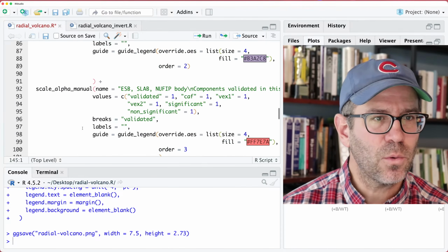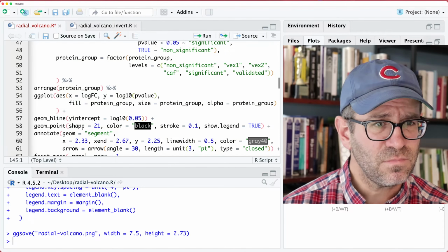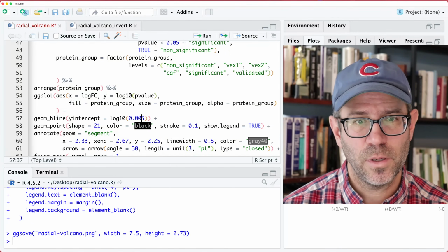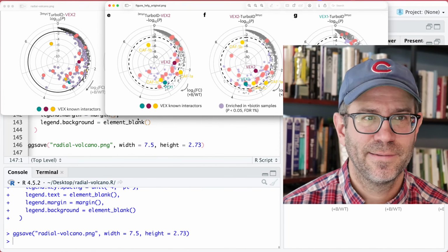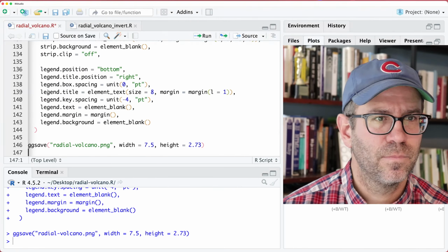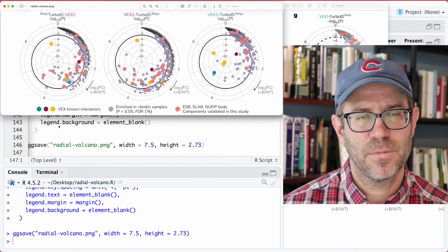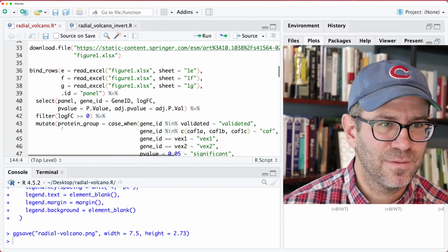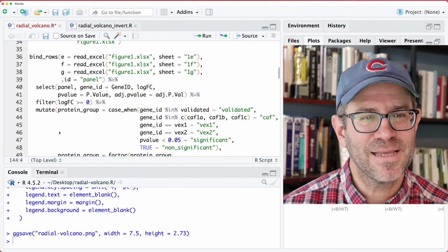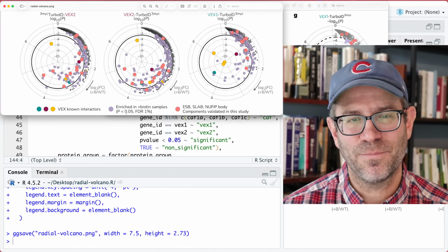And so I think what they plotted was 0.0025, right? Which is inside like that. So again, that's unfortunate because, as they say in their plot, these are the ones less than 0.05.